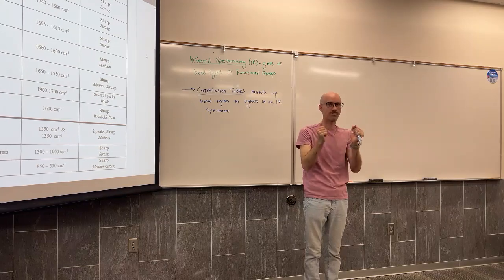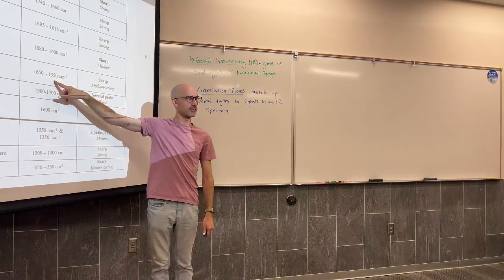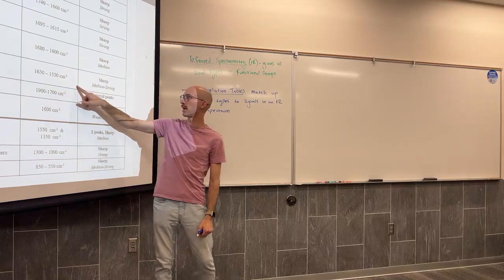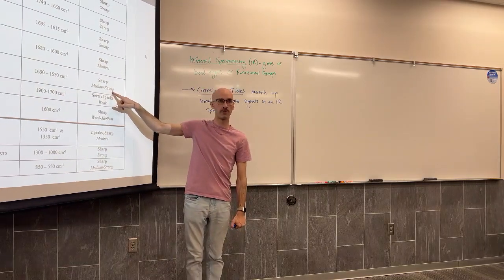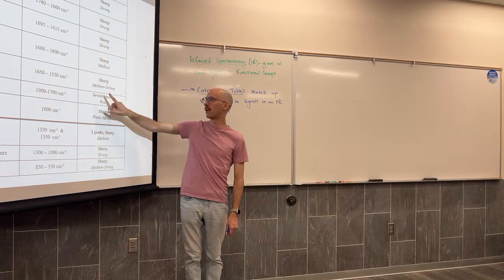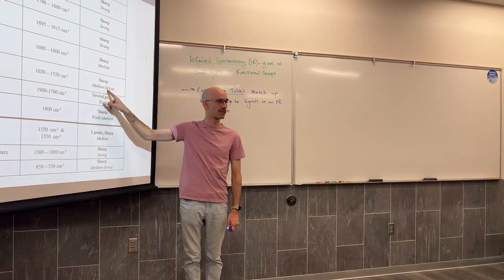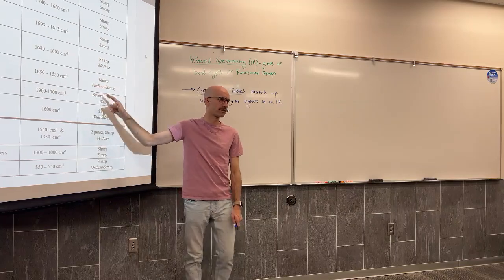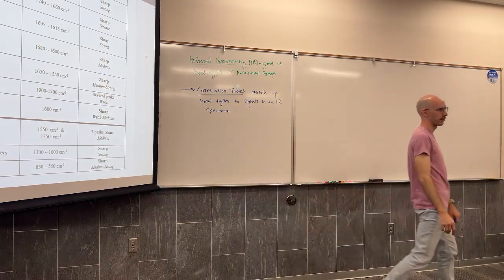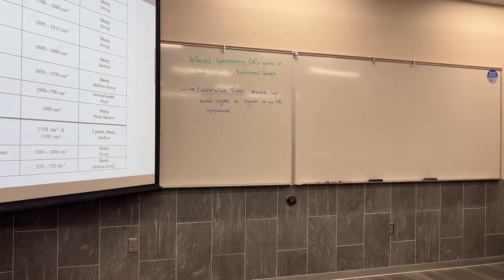And that motion takes a different amount of energy. So we look at a different frequency range, and we see that it absorbs not with 1 or 2 peaks, but always just 1, and it absorbs with a different intensity. It absorbs some to most of it, right? Medium to strong absorption. So different bond types also absorb in different ways, looking at the different energies that are needed.